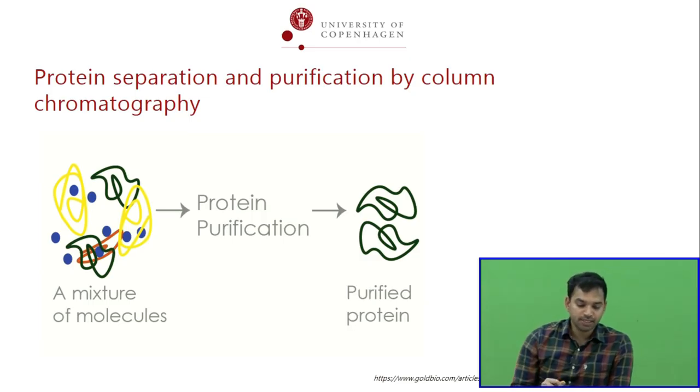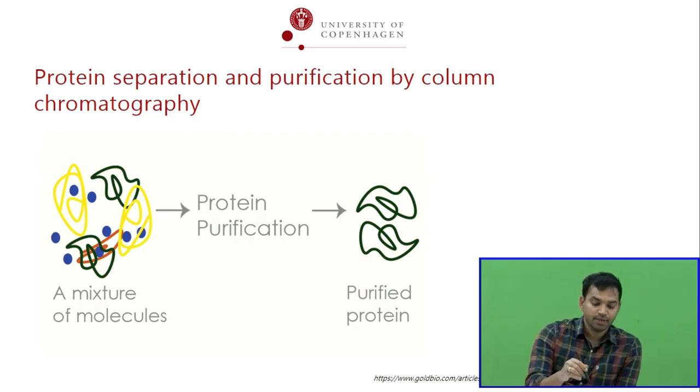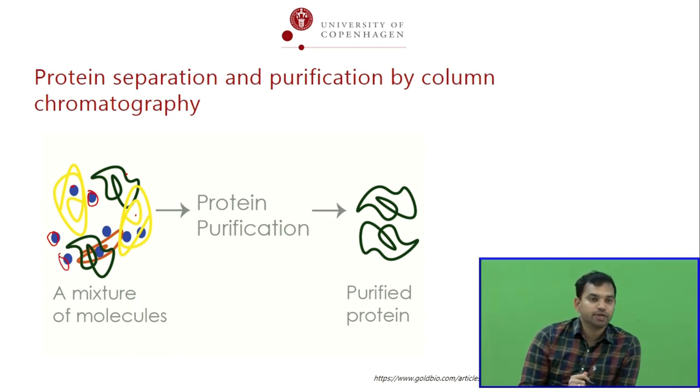Now this is just a nice illustration I got, and you can see that imagine these are your proteins, and you have a lot of impurities here. These impurities in our plant-based world could be polyphenols, anti-nutrients, small peptides, minerals, whatever, right?